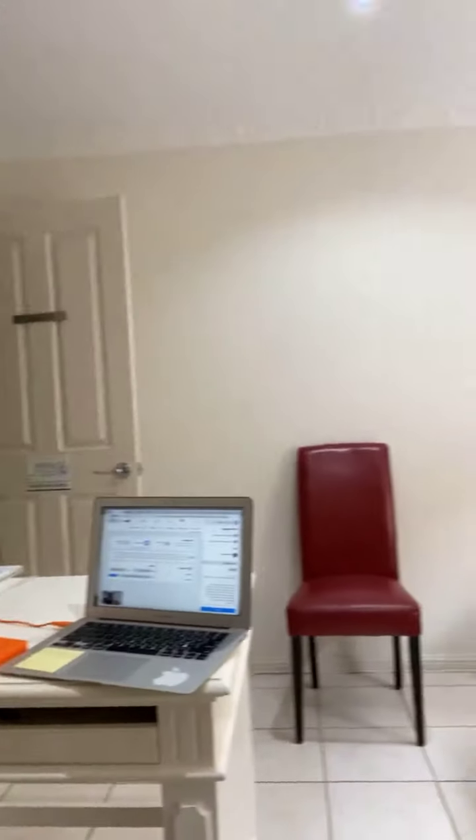Hello again, and don't you love this cool day! I'd like to show you behind the scenes in my little clinic room. This is my clinic room, and behind my desk is my usually hidden beautiful kit — my live and dry blood screening analysis tool that is part of the testing phase of what I do with clients. I thought I would introduce you to it so it can be revealed. Hello Debbie!